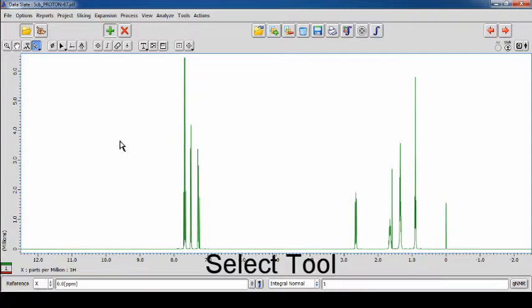When using drawing tools, such as Create Peaks tool or annotations, you can quickly change back to the Select tool by holding Ctrl on the keyboard. Your selection will be limited based on your previously used tool, but this can be seen by left-clicking over the cursor to open the drop menu. The symbol beside the lower cursor icon will tell you what your selection is limited to.